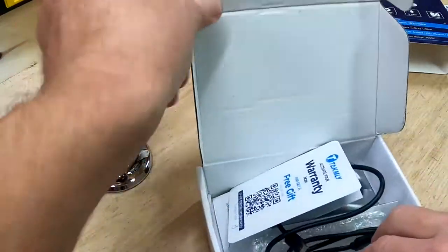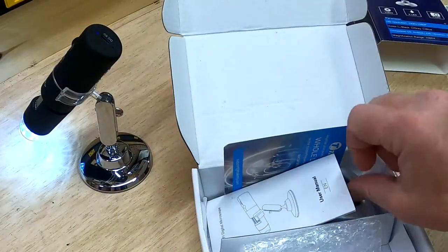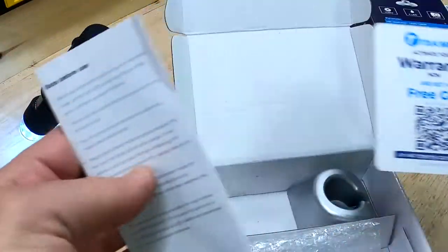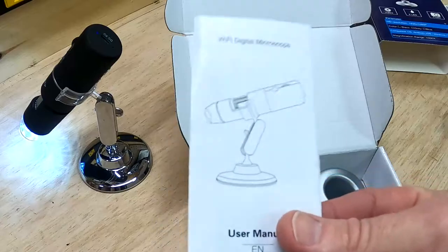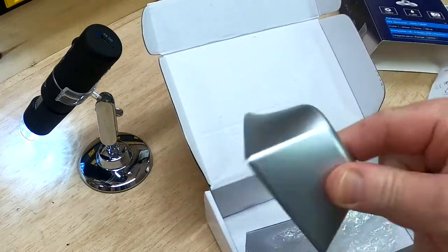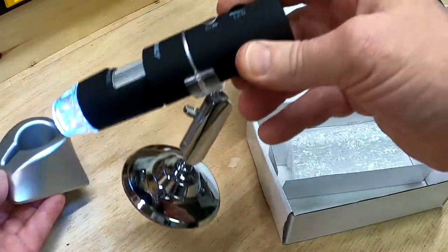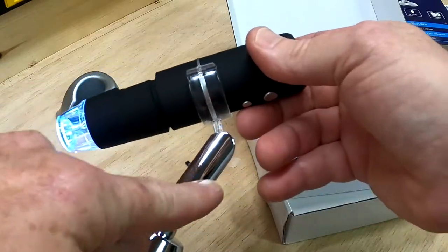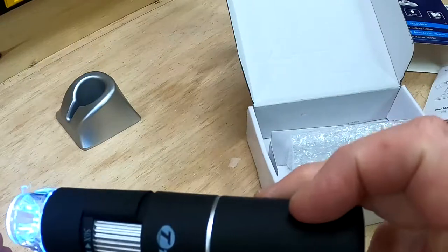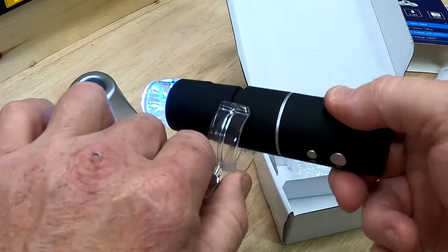In the package you get a USB charging cord, a warranty card, and some instructions — which you really don't need because it's super simple. You also get two bases: one that the front end just sits in, and another adjustable base that I prefer to use. You can take it out of the base and use it handheld, or keep it in the stand.